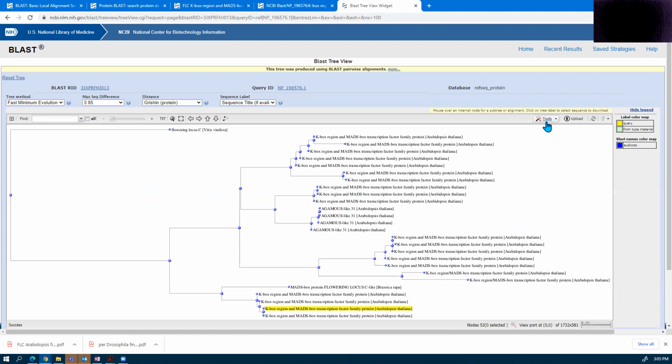So save this PDF and we can examine this in the lab the following week. This one is quite interesting. There appear to be lots of different duplication events in this one here. So this will be fun to explore in the following week.